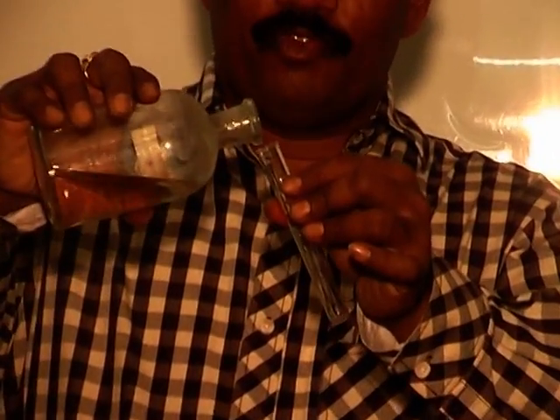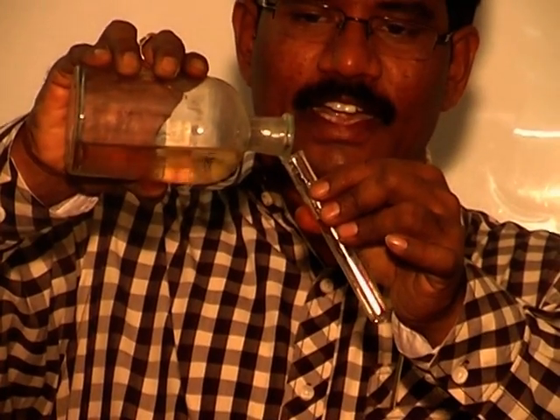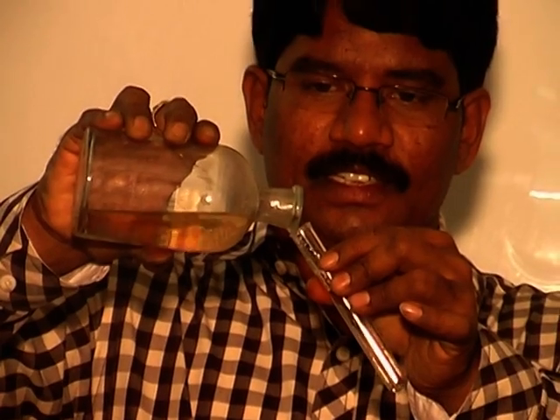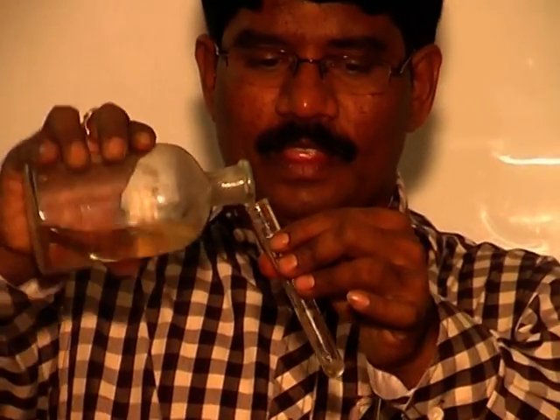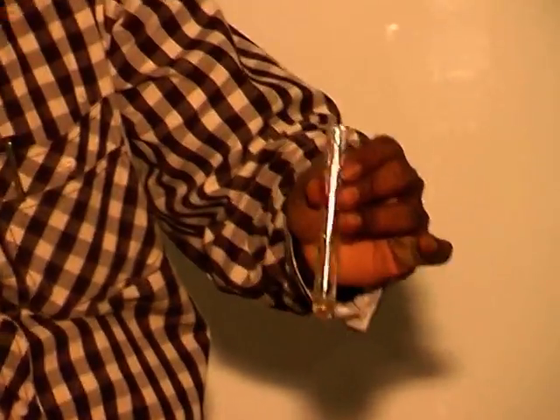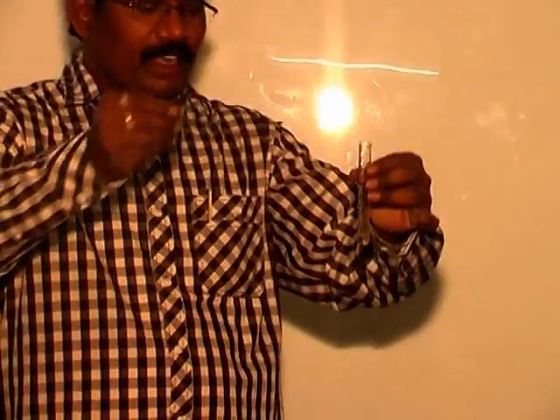In the Liebermann's test, we need to take that phenol, and to this a few drops or very small quantity of concentrated sulfuric acid is to be added. Then we need to add sodium nitrite crystals. This is sodium nitrite.